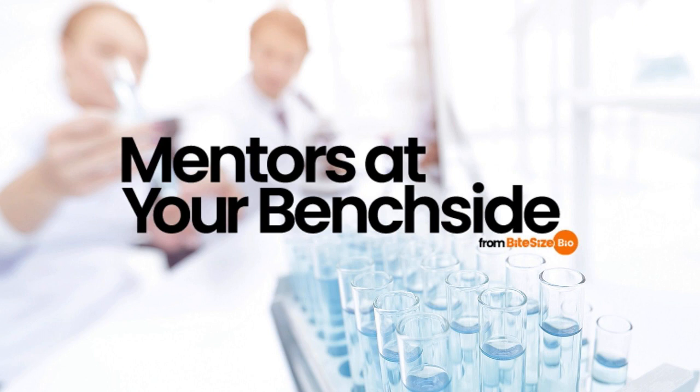Calibration involves adjusting or standardizing lab equipment so that it is more accurate and precise. Calibration typically requires comparing a standard to what your instrument is measuring and adjusting the instrumental software accordingly. The complexity of calibrating instruments or equipment varies wildly, but typically user manuals have recommended recalibration instructions.